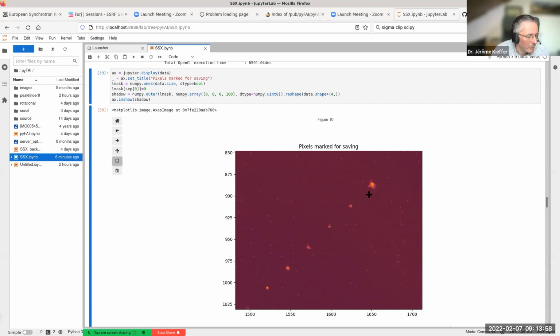They are receiving buffers directly in UDP. I don't know exactly all the details, but then they take the buffers from the different modules. They assemble them into 4 megapixel images, before pedestal correction, so uint16, which are sent to the GPU where they are pedestal corrected, and then sigma clipped.